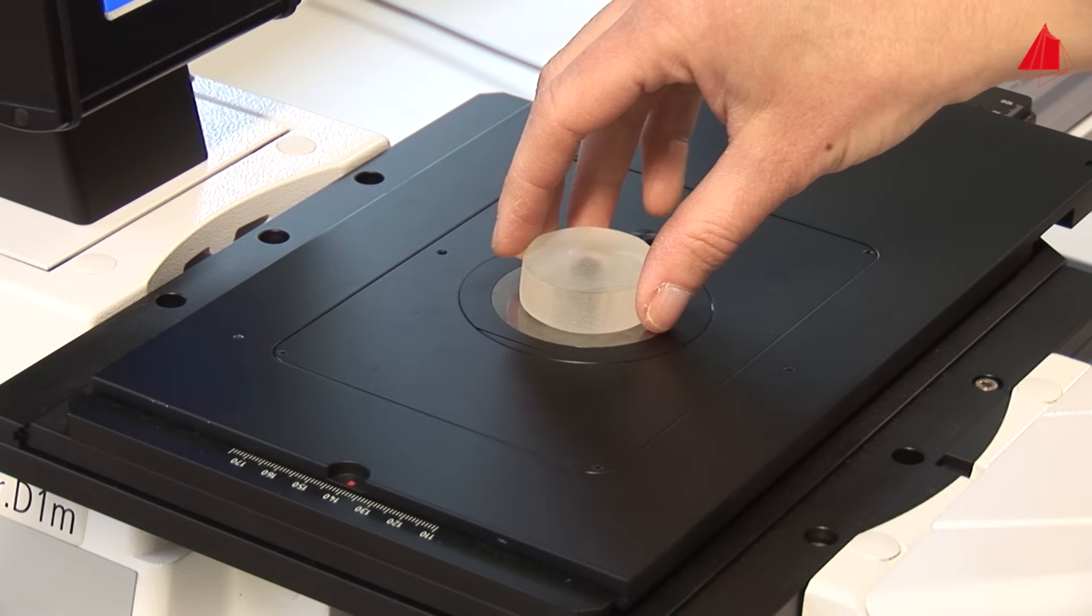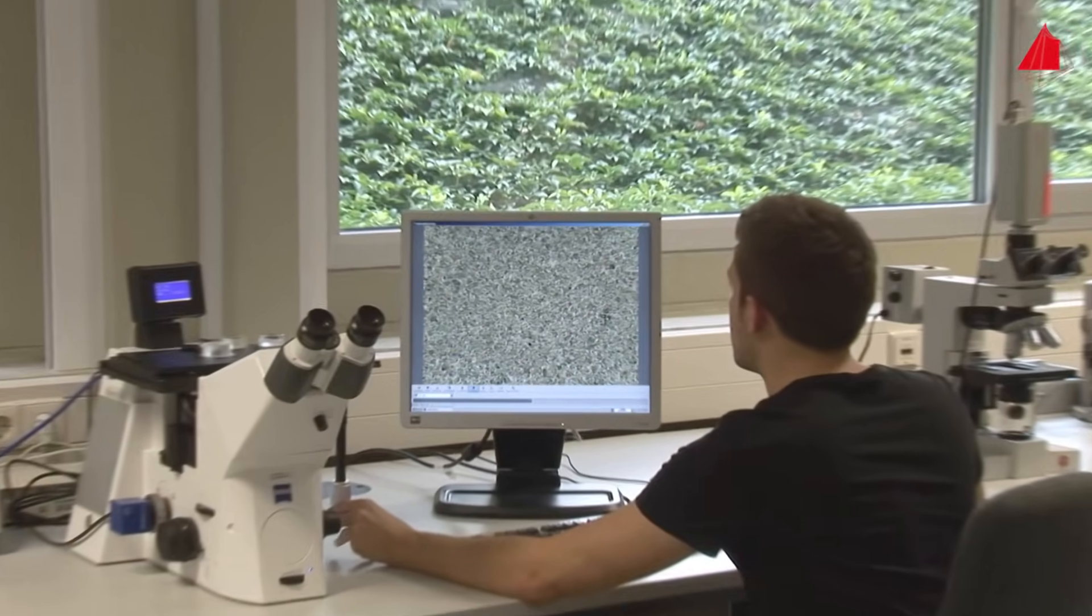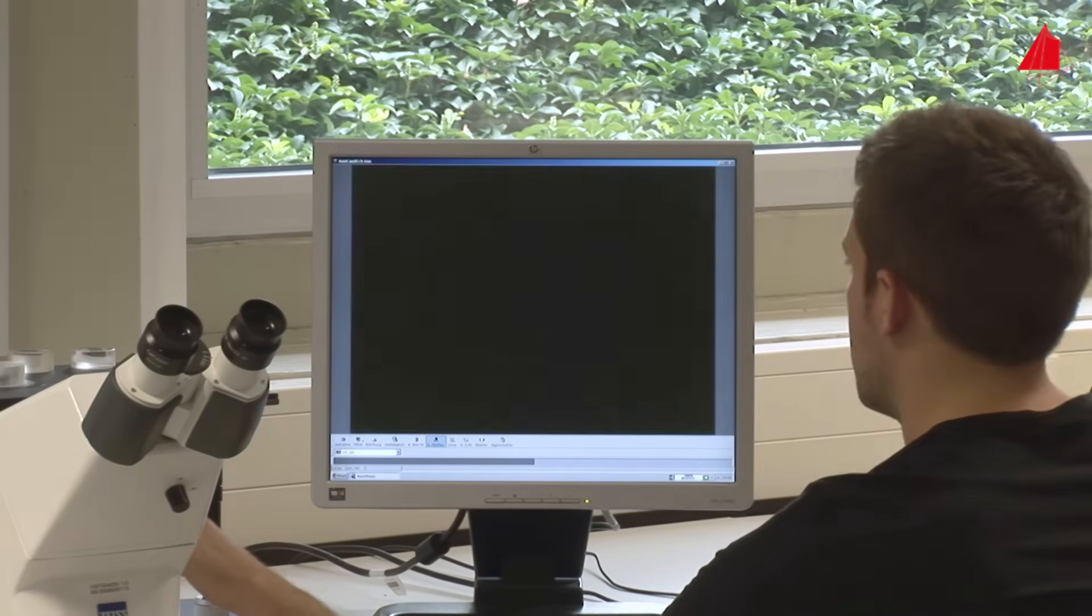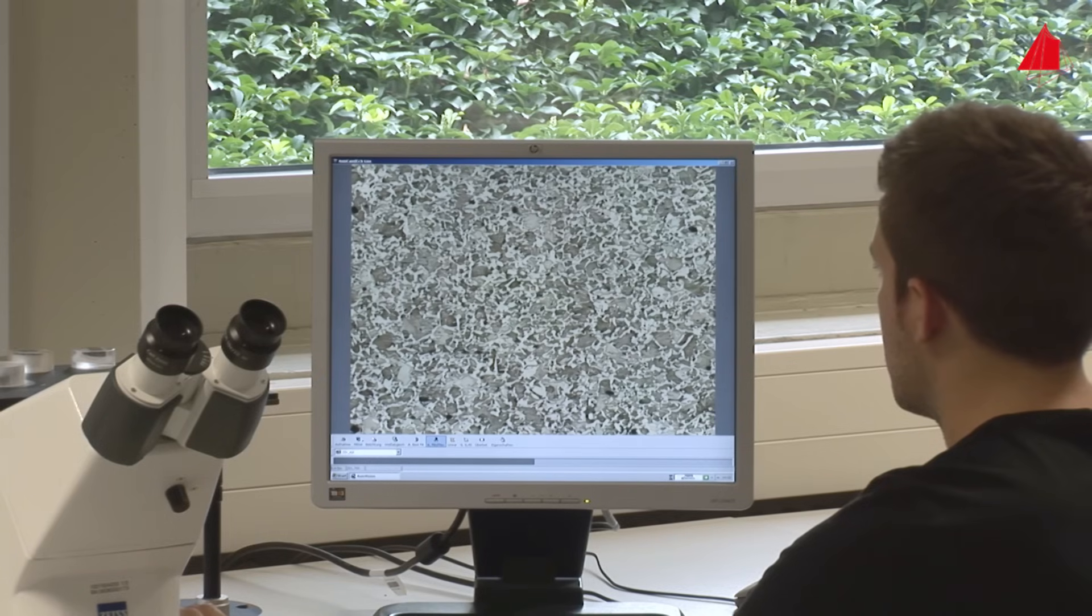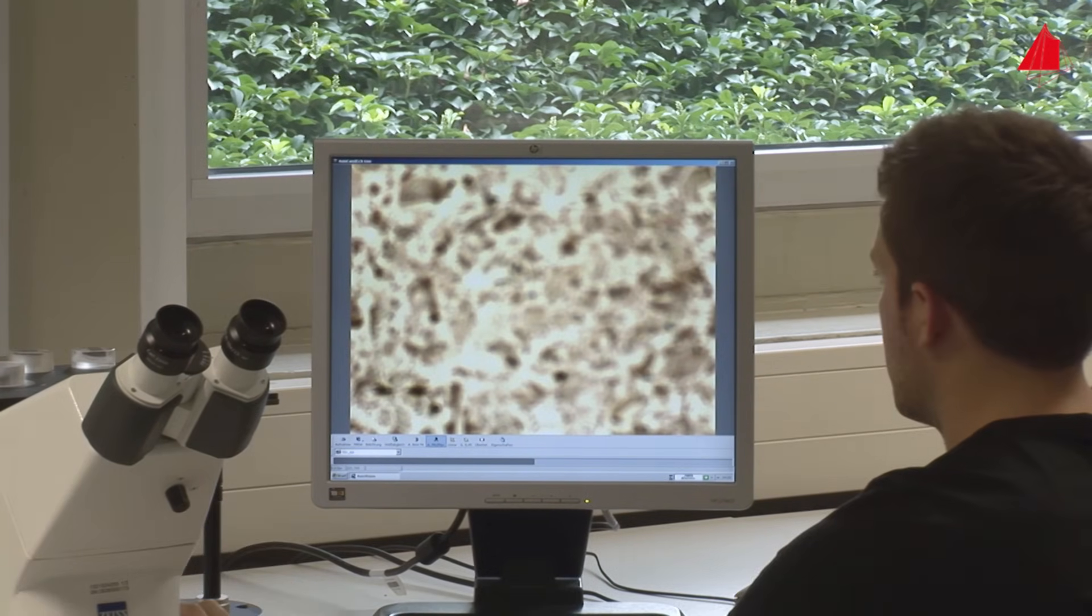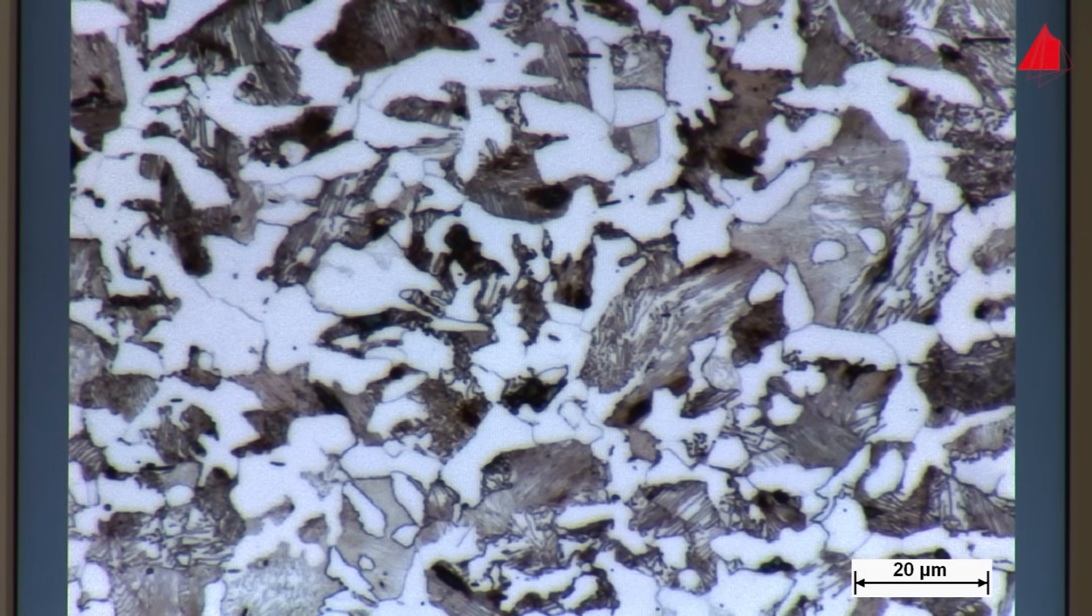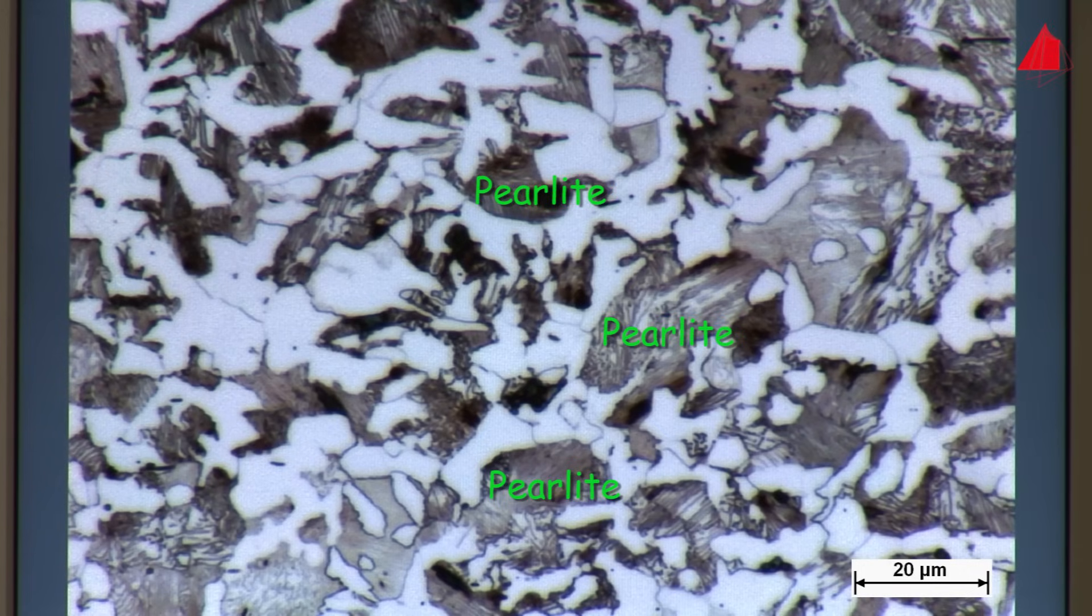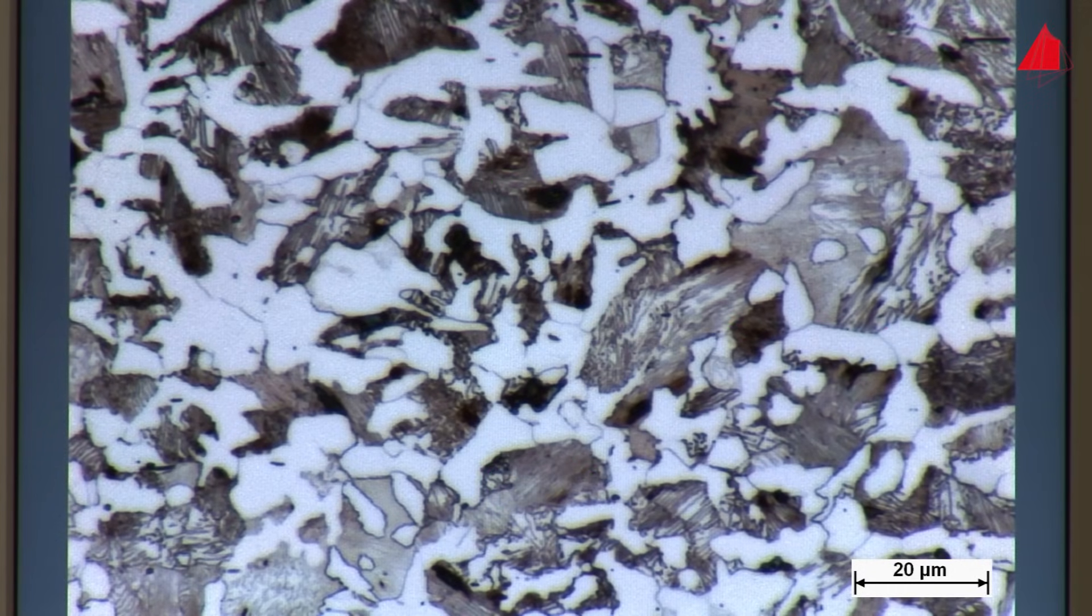The excitement increases. Was the etching time correct? Has everything worked out fine? At low magnification, not much can be seen which looks characteristic. The tester gradually switches over to higher magnification. In between, he focuses and adjusts the brightness. At medium magnification, light and dark areas become visible. At comparatively high magnification, in some of the dark areas, fine stripes may be recognized. The microstructure in the darker striped regions is termed perlite. Perlite consists of thin alternating crystals of ferrite and cementite. The white regions are ferrite crystals. They consist of almost pure iron. Great! The etching has been successful.